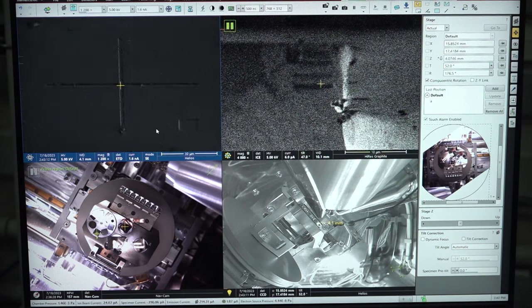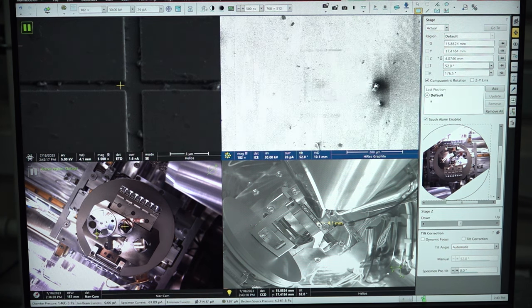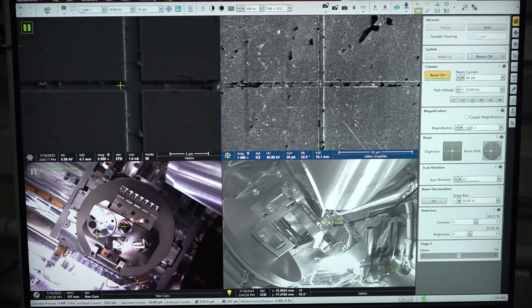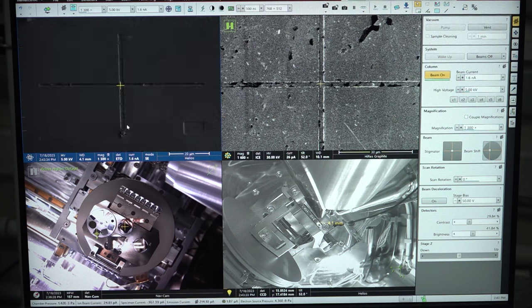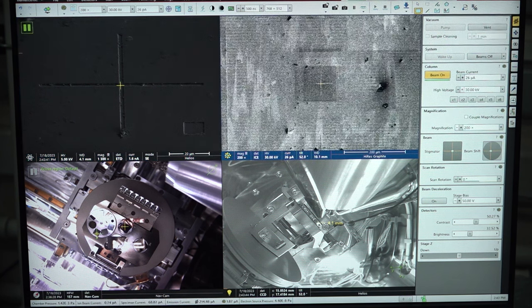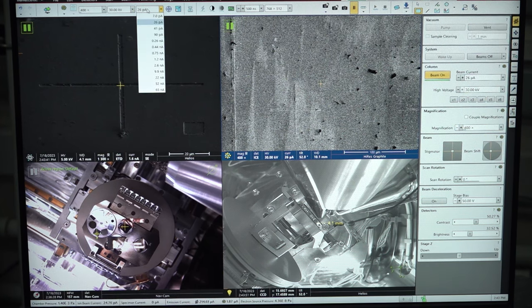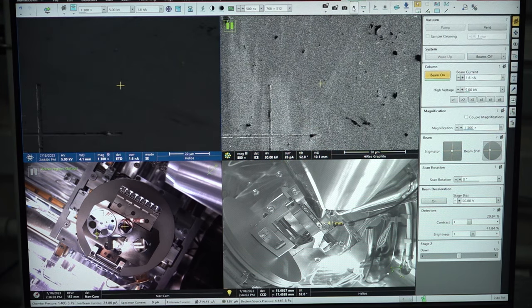Now the image seen in SEM is a cross section. What you see in SEM is the cross section image, and what you see in the ion beam should be the top surface image. The ion beam is active — I am seeing the same reference here. Both images are linked and we are at the same reference point at the center crosshair. For performing any milling or deposition operations we will use the ion beam. I have started the ion beam at 30 kV and 26 picoampere. Higher currents will damage the sample surface, so we always start with a picoampere current. I choose a region of interest using SEM to avoid any damage.